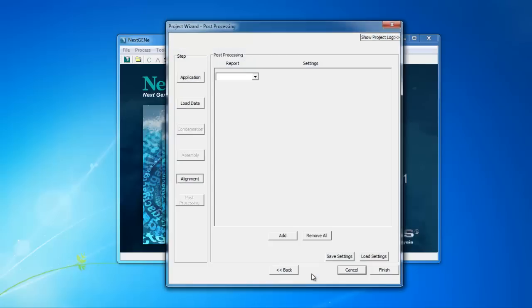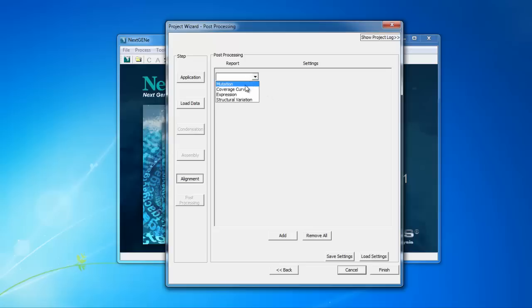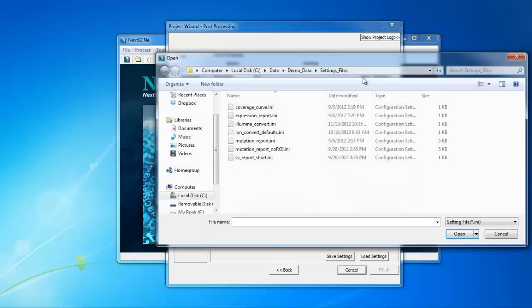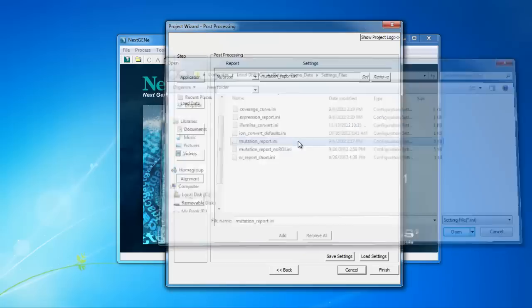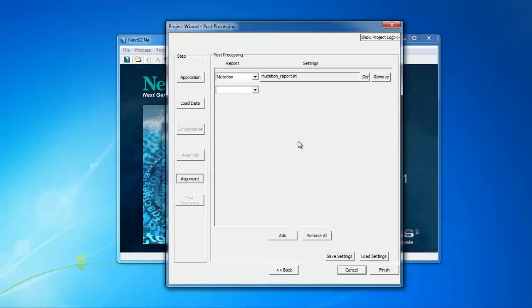The post processing step allows you to automatically save reports as part of the analysis. To automatically save a report, select it from the drop down menu, for instance the mutation report. For each report that is selected, you must also click Set to select a pre-saved settings file to define the options for saving the report. Once you've selected all the reports you'd like to include and loaded a settings file for each, click Finish.